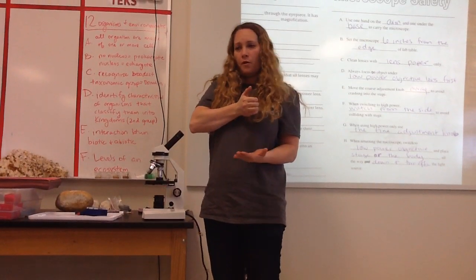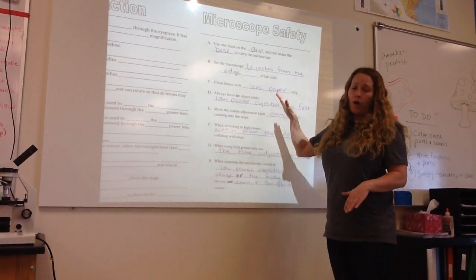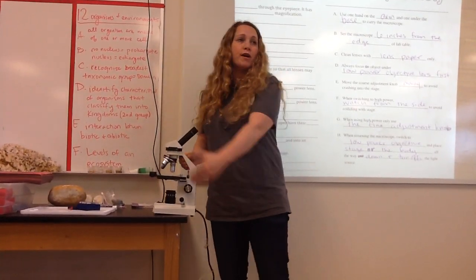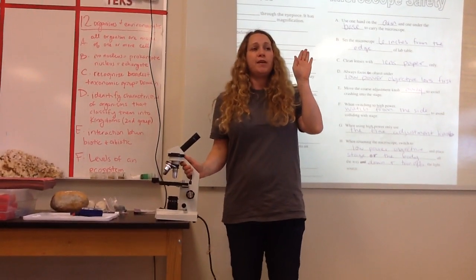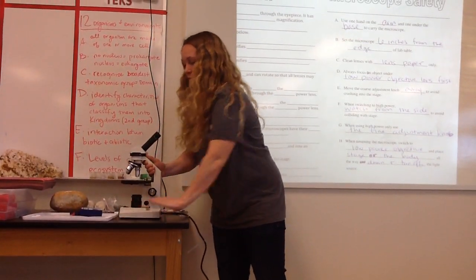All right, great job. All right, the second thing you need to know is set the microscope 6 inches from the edge of the lab table. So, after you carry it and you come to the table, you want to look down. If you set it like this, you're putting it at risk. Okay, so you want to make sure, you can use your hand to measure 6 inches. It might not be perfect 6 inches, but it's just for safety. So a little bit in and a little bit in on the other side.